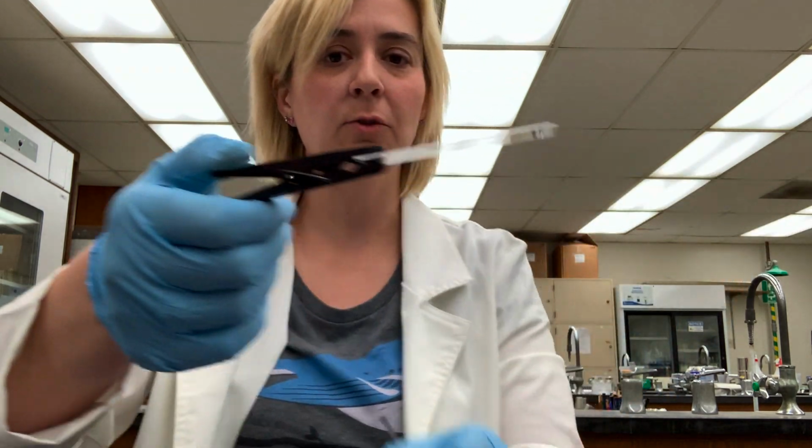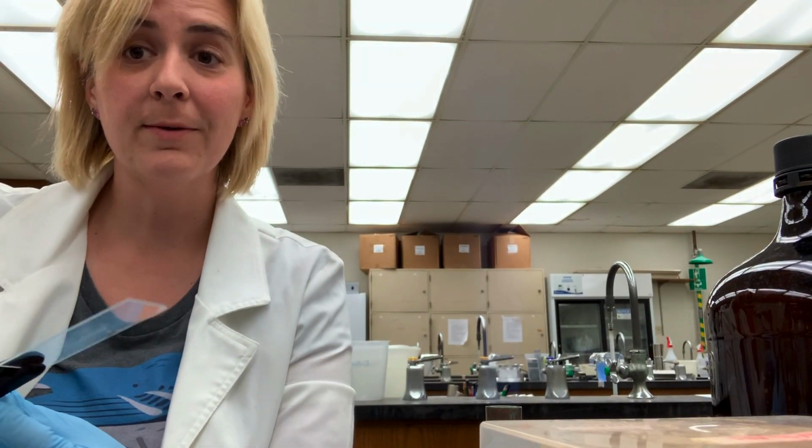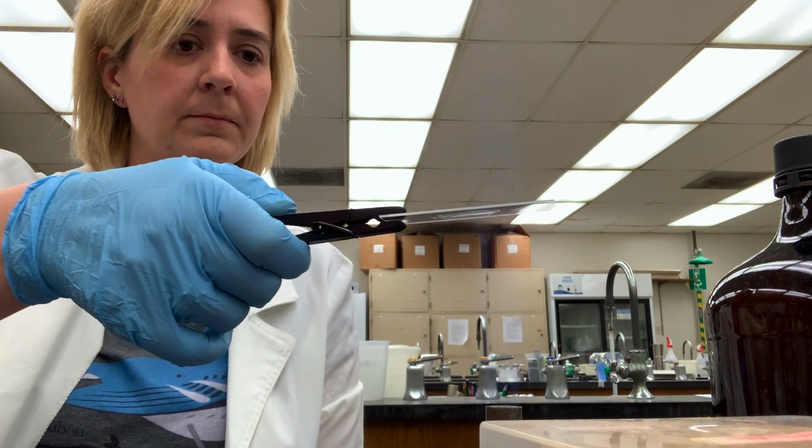So I'm going to pass it through the Bunsen burner. Let me scoot this over a little bit so we can see. Now, I'm not trying to fry my cells. I am not trying to cook my cells. I'm just passing through the flame, three or four times maybe. And I'm going to put that slide back now on my slide rack. I will move us over so we can do the first staining step.